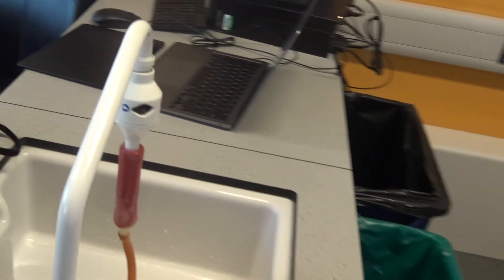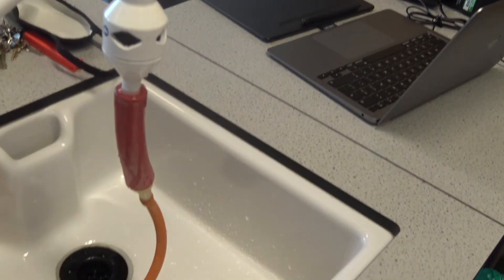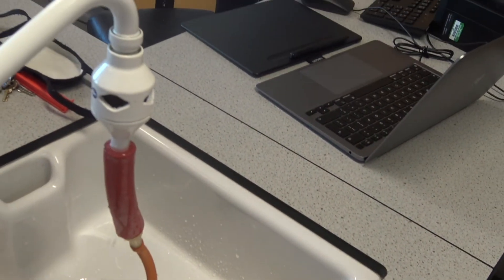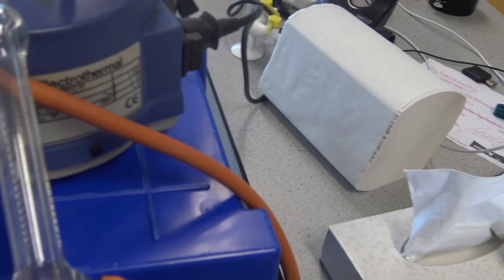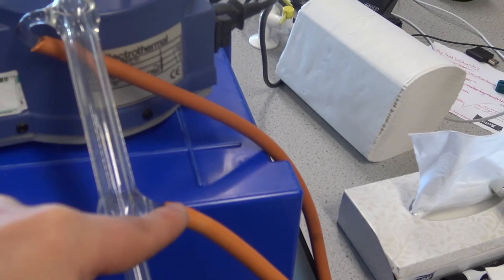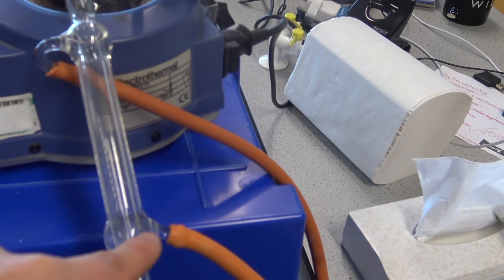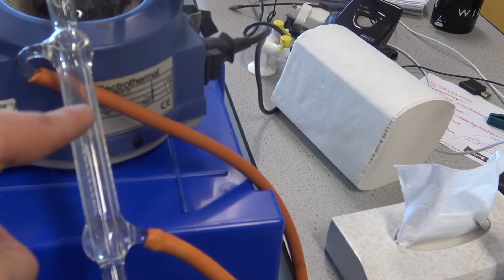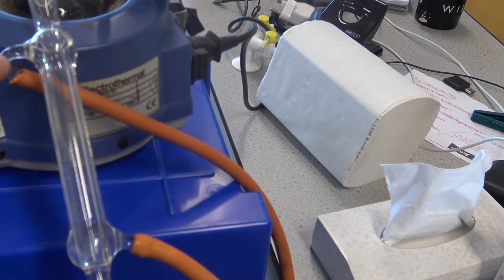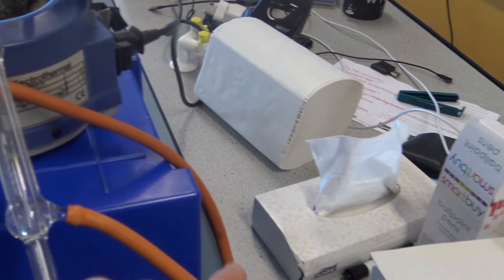But before we do that, I just want to show how this condenser works. It's connected to a tap, and the tap is connected here to the bottom end of my Liebig condenser. So the water travels into my Liebig condenser at the bottom, travels all the way up to the top, and back around and down.